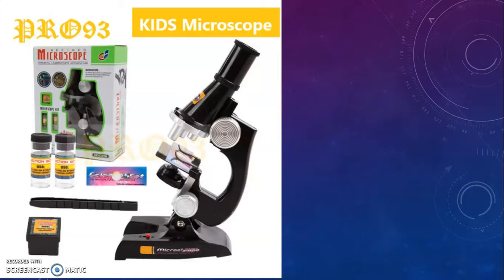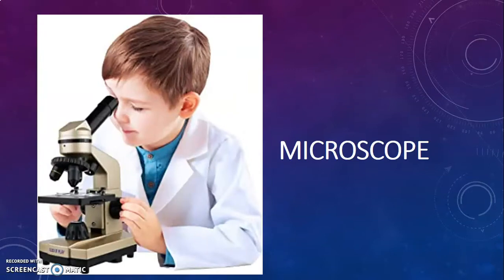To see tiny objects or tiny bacteria or tiny organisms in the food, in some places, in insects, the parts of the insects, with the microscope. It's good to understand that the microscope is very important because we can see tiny particles of things. So the microscope is one of the instruments that you have to learn.